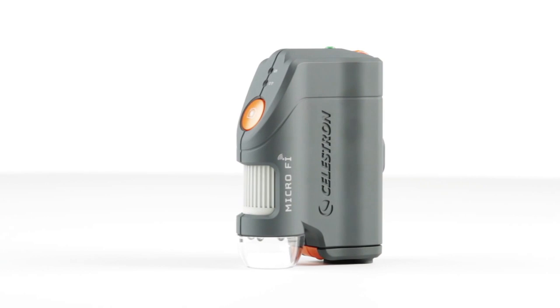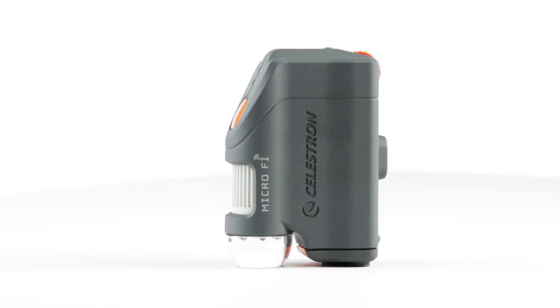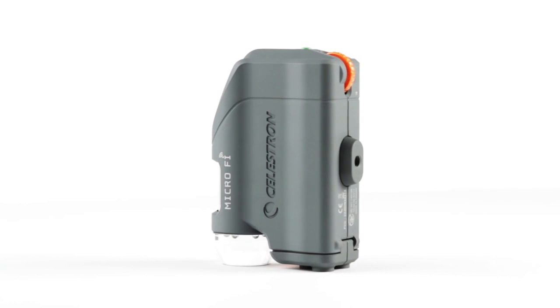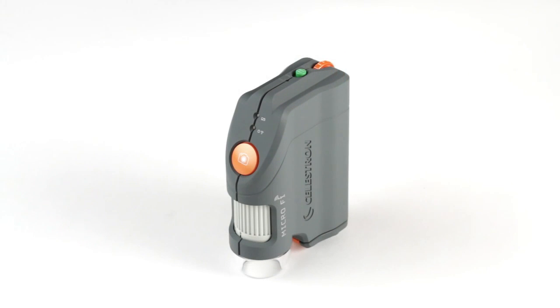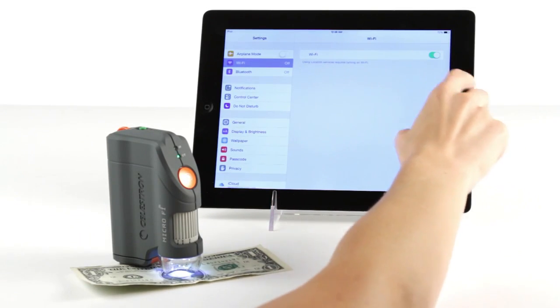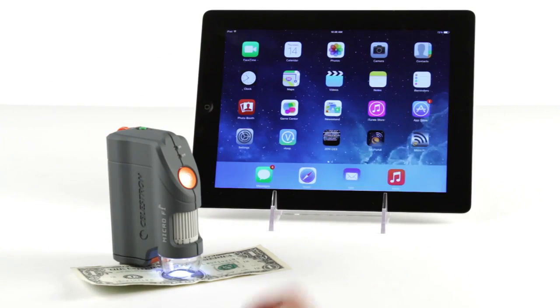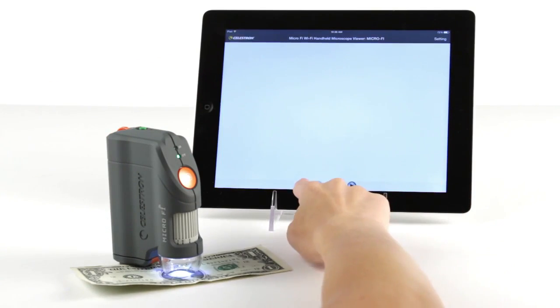Celestron's innovative MicroFi Wi-Fi microscope is the easiest way to save images and video of 3D specimens directly to your mobile device. Simply switch it on and MicroFi generates its own Wi-Fi network. Connect to the network through your settings, launch the MicroFi app, and you're ready to view a live stream on your device's screen.